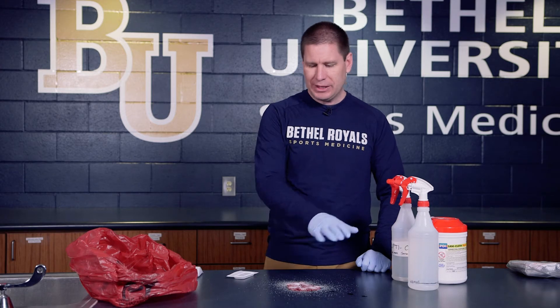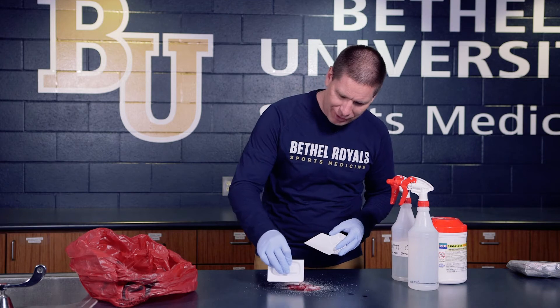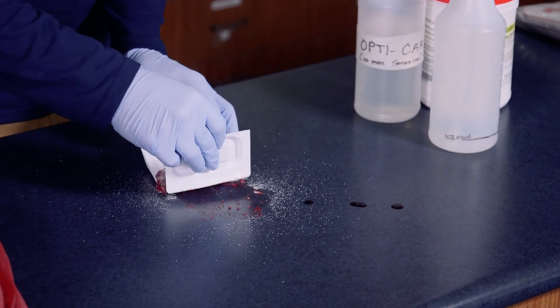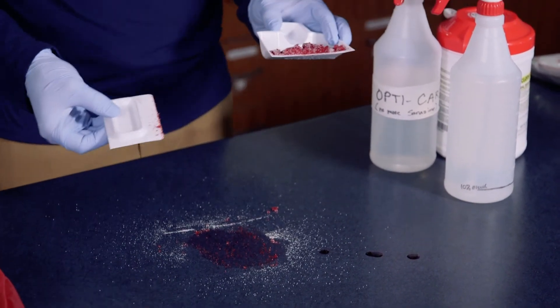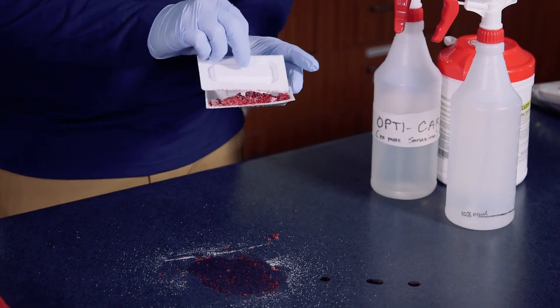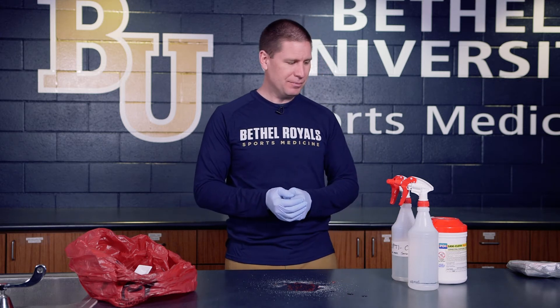I'll still need to spray it down, but the solidifier allows it to be cleaned up in a fairly easy fashion. In the bag there are a couple of small tools: a little shovel and a scraper. You can see how it has balled up the fluid and turned it much more into a powder, making it easy to clean off that surface. This is not reusable — it's a one-time item. Place it in the biohazard container and now you can clean up the rest of the surface area.